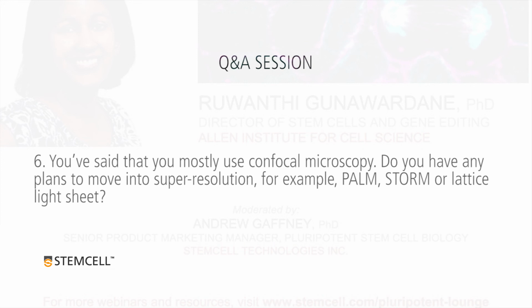And these cells are quite large, so it takes a while to get a Z-stack because they're about 15 to 20 microns tall. So these are all the challenges we are now having to deal with working with stem cells and looking at dynamics, and then start to work on cardiomyocytes, which are beating, but we still want to do live imaging. So, but nothing's off the table. This is just what we started with.